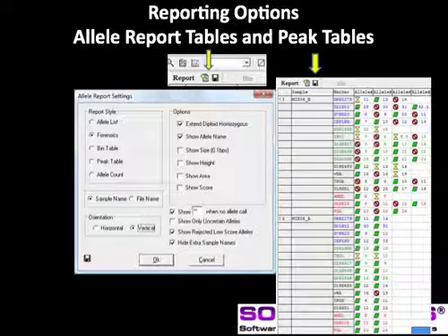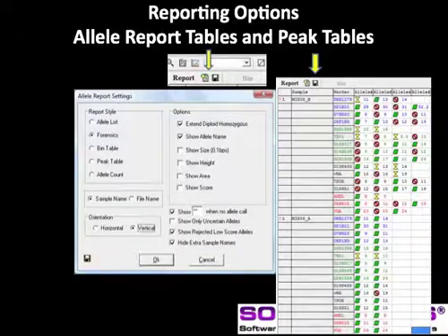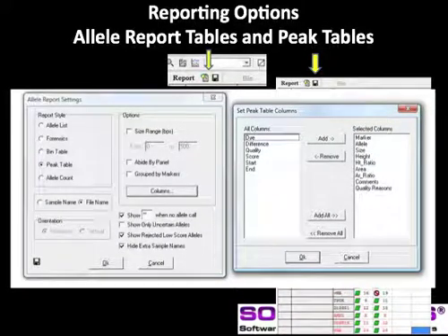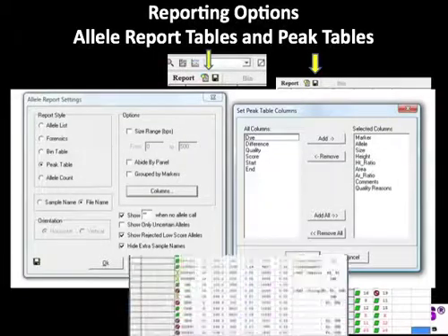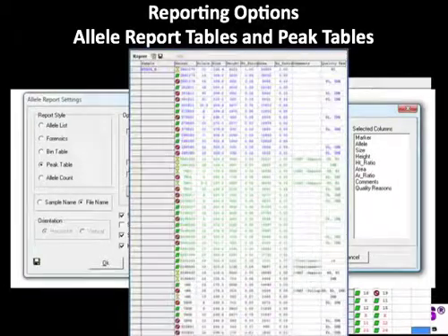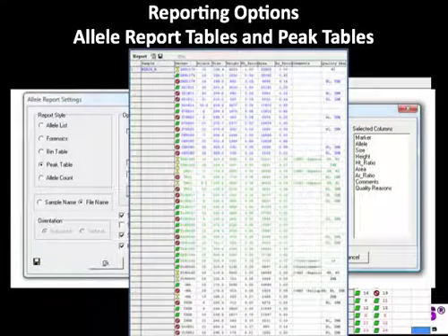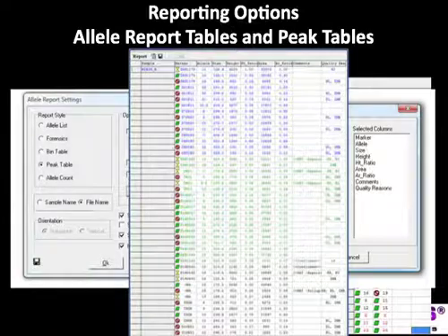Another commonly used format is the peak table, where the analyst may select from a list of column headings to include in the report table, as seen in this report table example.